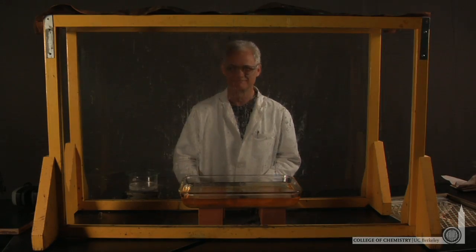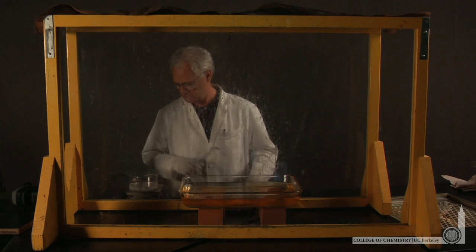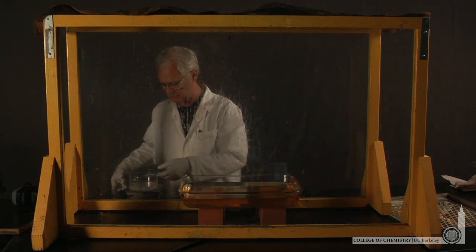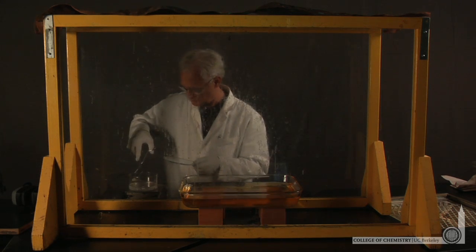We are in the lab where Lani is going to show us the reaction of alkali metals with water. The first is sodium.